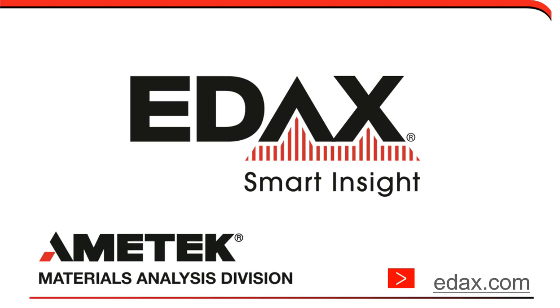And of course, it's a package that's, I say of course, I did a webinar 2 months ago, so it's of course to me, but it's a 64-bit application. So it's really designed to handle larger data sets, to use modern computers, modern processors, and be more efficient in operation, be more responsive.